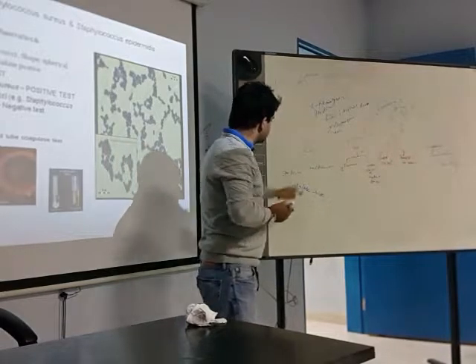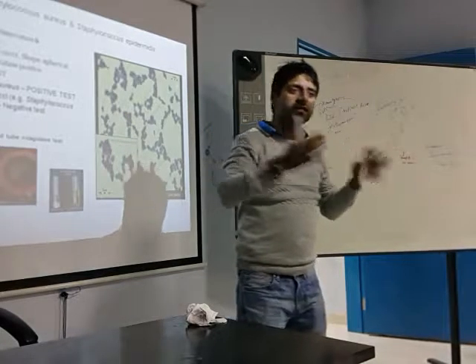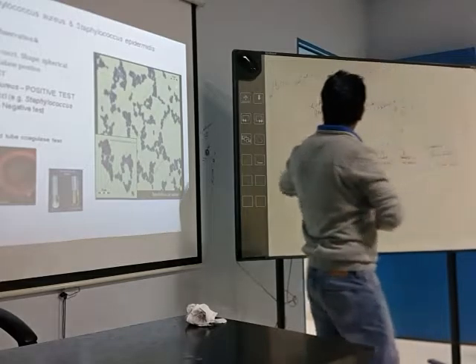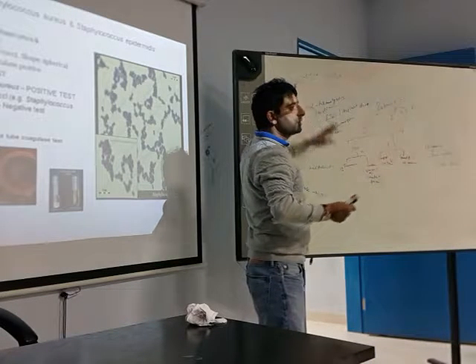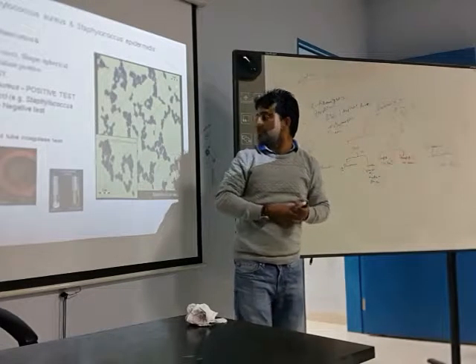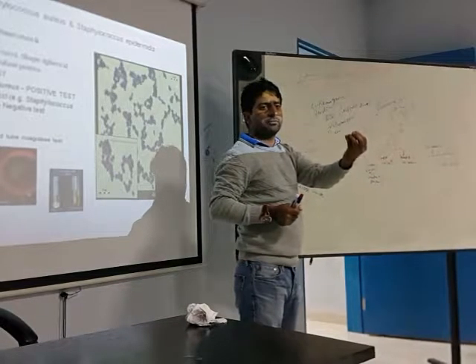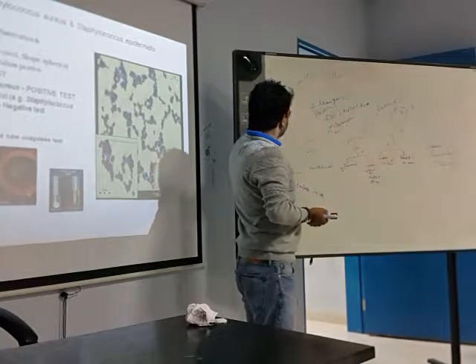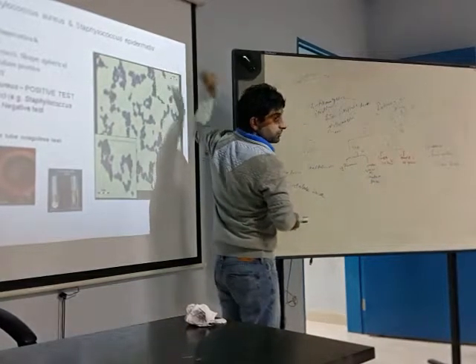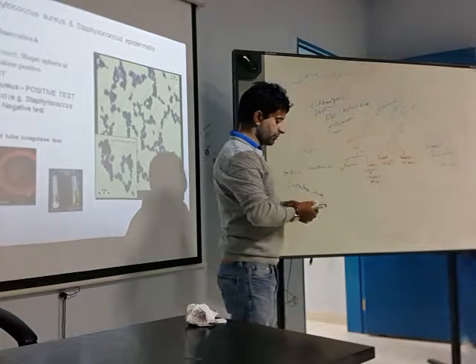So some microbes have been given catalase enzyme activity. This enzyme protects the bacteria from the free radicals that are produced inside the body. For example, if you put this bacteria in hydrogen peroxide, it will survive, because it will degrade the peroxide. And you have seen the bubbles form in the catalase reaction. So both Staphylococcus aureus and epidermidis are catalase positive.